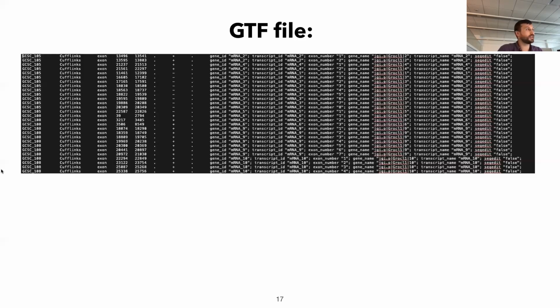Think about this GTF file, right? So the GTF file are genes from the genome, right? So what two types of genes do you expect to see in your expression table?